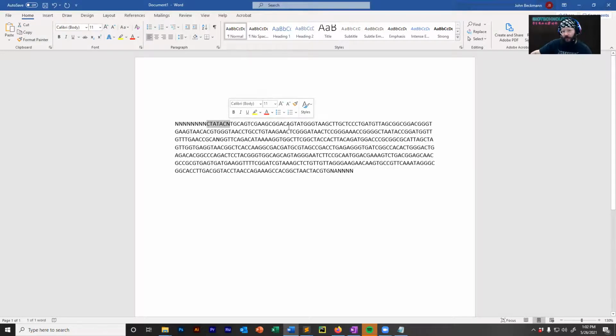That's an important skill, learning how to interpret and look at DNA sequences and find patterns in them. Many of the algorithms or computer programs might assist you, but they won't teach you the foundations that you need to know. So there's a huge benefit to starting very, very simple and learning how to analyze Sanger data in Word.